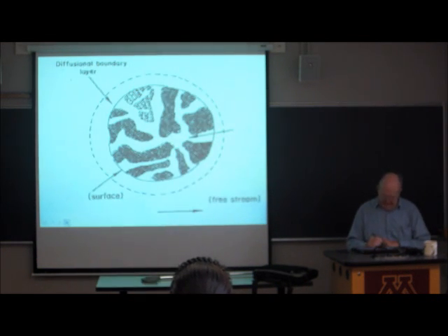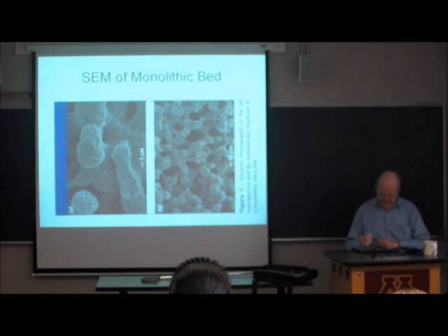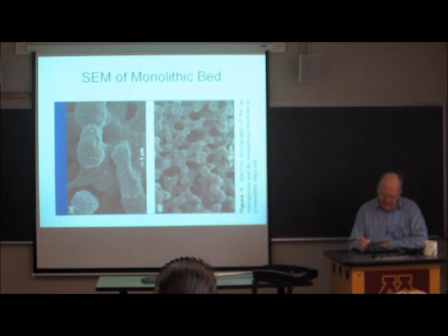I'm going to skip that for the time being. Here's a neat material called a monolithic bed. This turns out to be a silica bed.